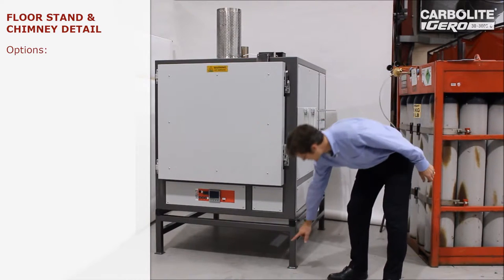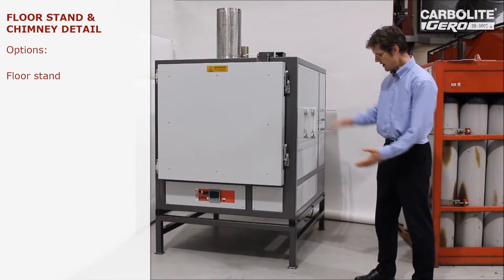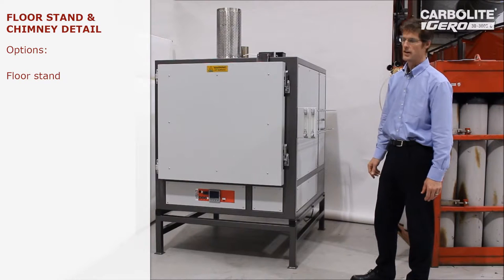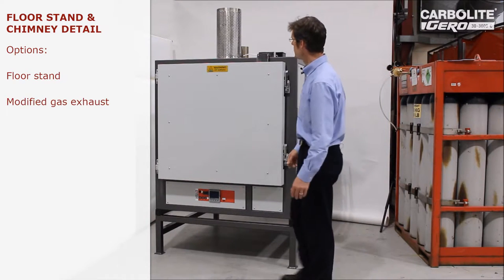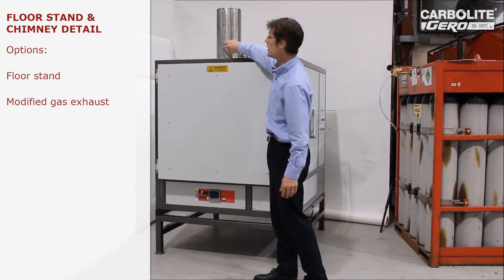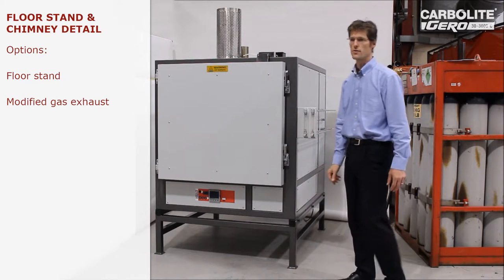This oven is mounted on a stand, which is an optional extra and can be made to any height to raise the oven to a convenient working height as the customer desires. The gas that we're passing through the chamber to modify the atmosphere comes out of an exhaust pipe here. This is just a heat shield to prevent anybody touching the hot exhaust pipe.